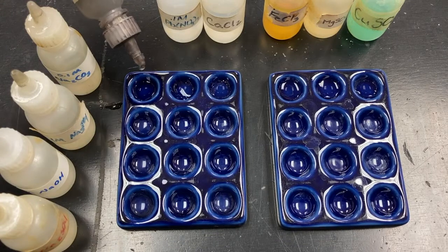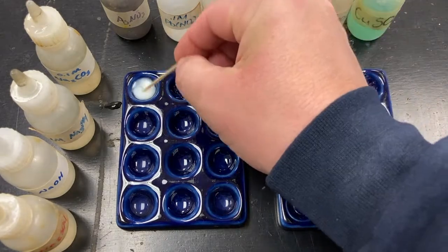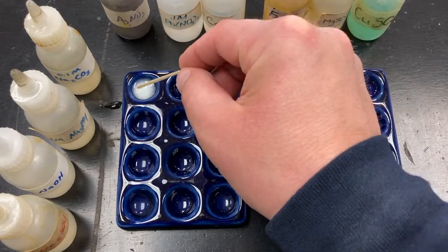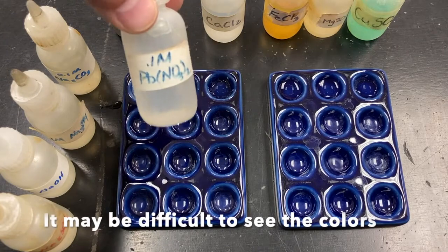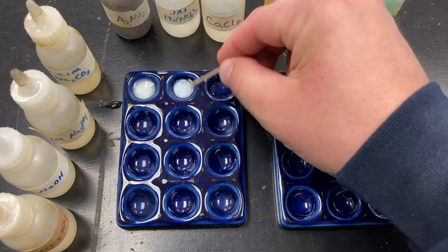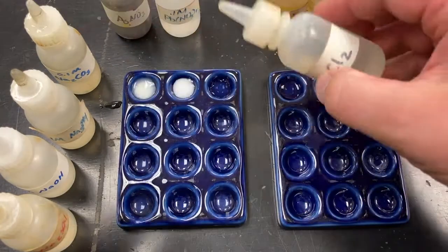silver nitrate. So we can see that there is a white solid there, kind of a white specks. You can see individual small white specks of solid. Okay. I'll get a close-up of these later. Let's do lead nitrate with the same substance. There's also a white solid, but it's more cloudy. It's more of a white cloudy precipitate. Calcium chloride.